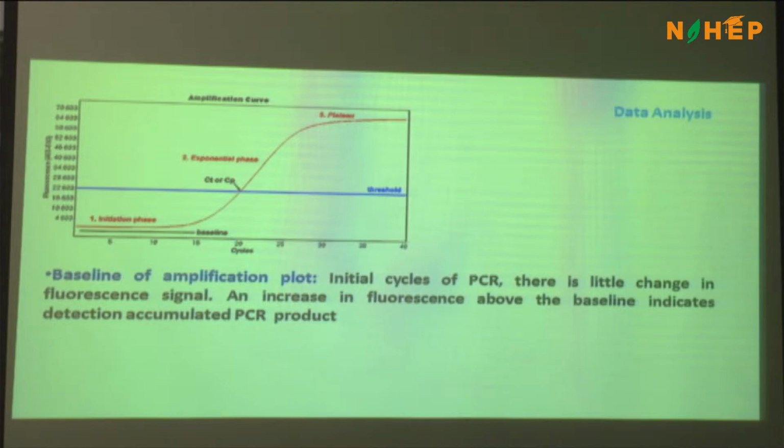And the data analysis is all about conversion of these CQ values into interpretable parameters. For example, fold change. I think the team will teach you how to do that. The CQ value is transformed into another easy to understand parameter. That is what is called fold change most often. And there is statistics in play. So we will be teaching how to use certain statistical tools to determine the significance of the fold change. Okay.